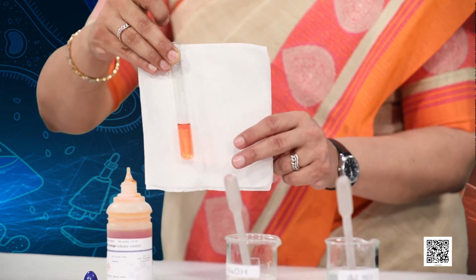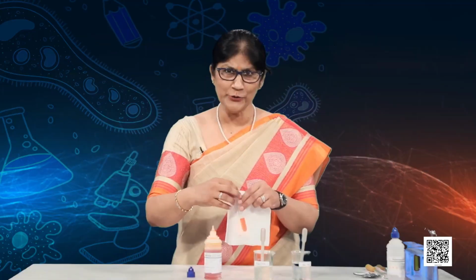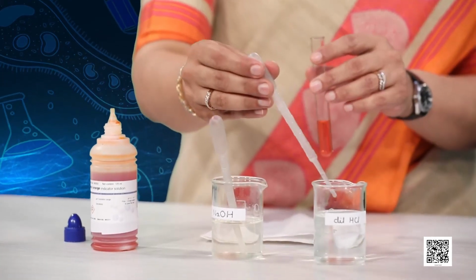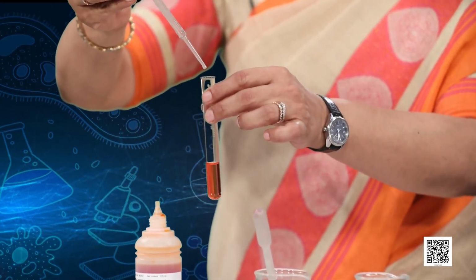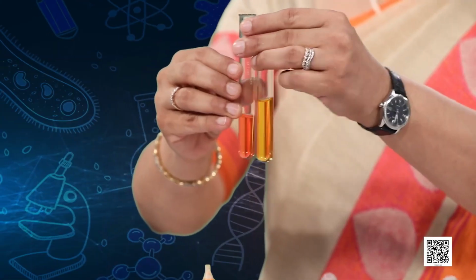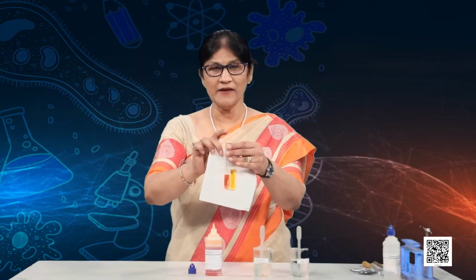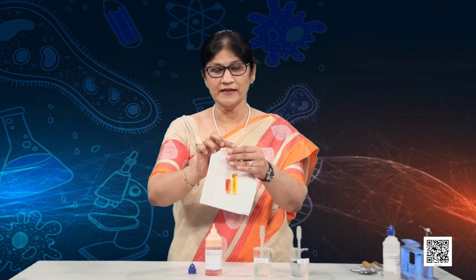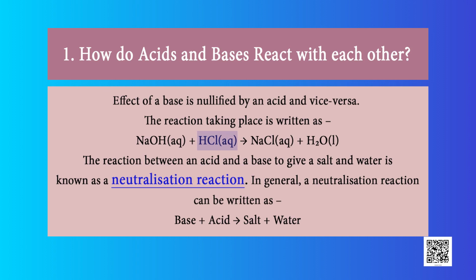Let us see how the color changes if I add some sodium hydroxide to it. Do you expect a color change? So taking some sodium hydroxide and putting it in this, let's compare the colors. So this was the color with acid, and now when I have added some sodium hydroxide, the color has changed to yellow. This is neutralization. The HCl and sodium hydroxide have reacted with each other and give us a neutralization reaction.